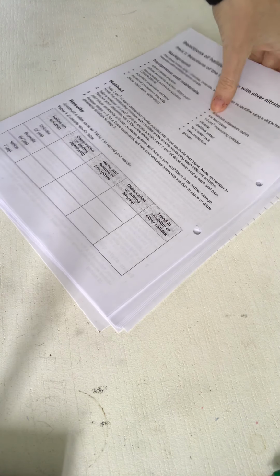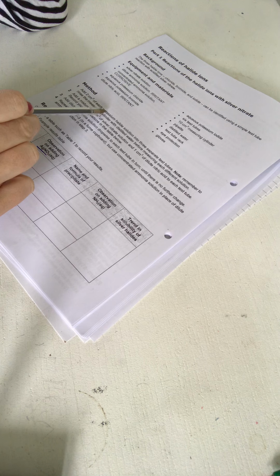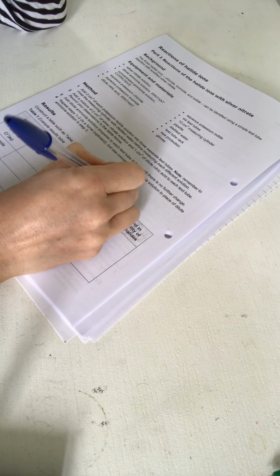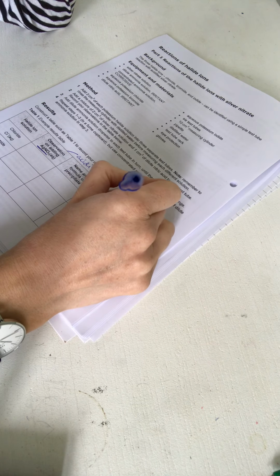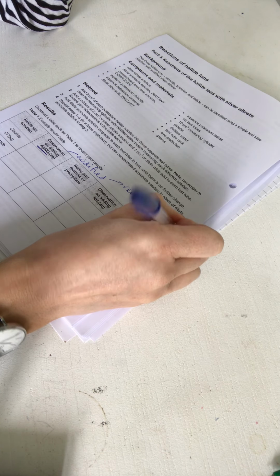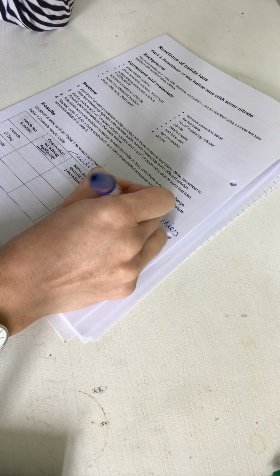And you add some, if you remember, silver nitrate, AgNO3, to either potassium chloride, potassium bromide, or potassium iodide. This is actually acidified, this silver nitrate, and you do need to know the reason for that. The reason is it removes any impurities, specifically any carbonate ions that might be present in the solution, and you do want to be specific in your answer as and where you can.